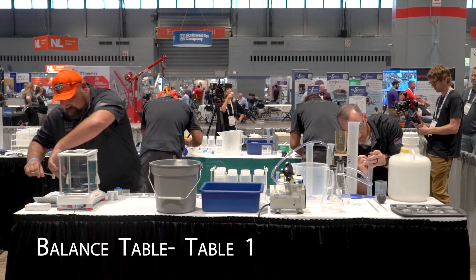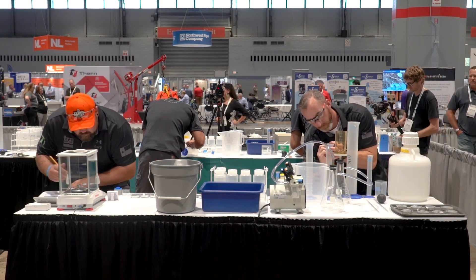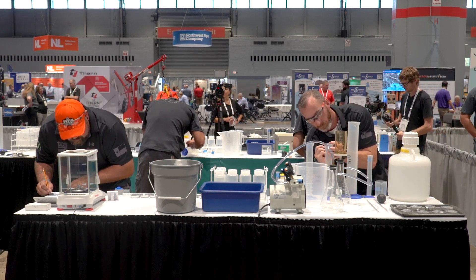First, take out your calibration weight. Remember, don't touch the weight — the oils from your hands will interrupt the weight on the balance. Use the tongs to move that over.